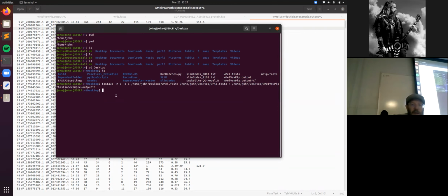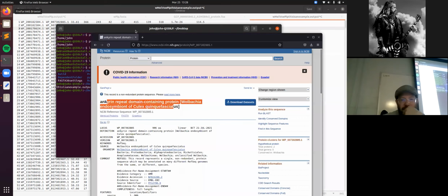Are there any questions, or do you want me to try anything or show you anything? Or is that kind of it? Can you download something and then show us what we can expect to see? That's a good idea. Dependencies? Yes. Let's try to find something to download.